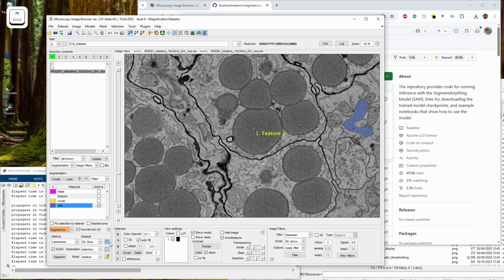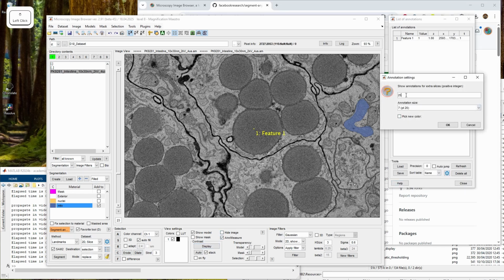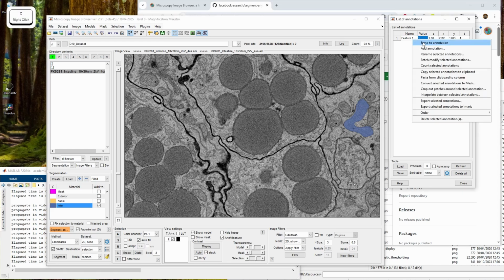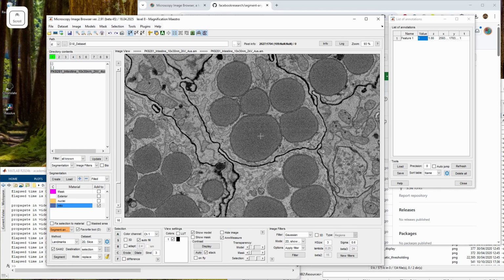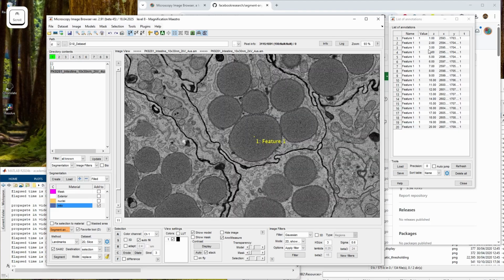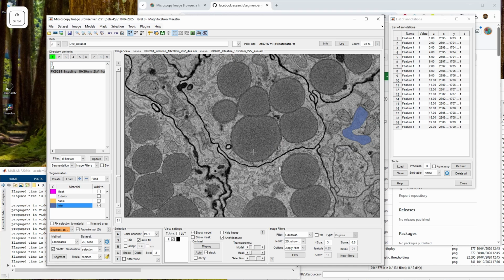So I click, and it says the value 1, which means a positive seed, and then I can scroll. Sorry, I just have this in my settings, not here, on this one, it shows multiple slices. So I have this seed here, and then I scroll and shift click, and you can see that this seed was interpolated for all slices.